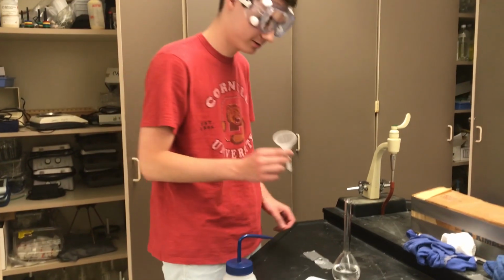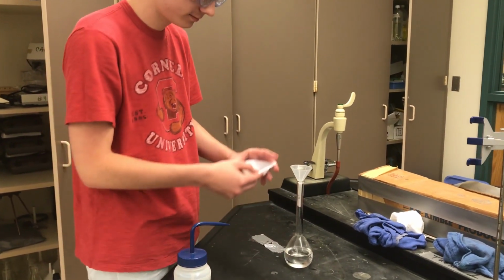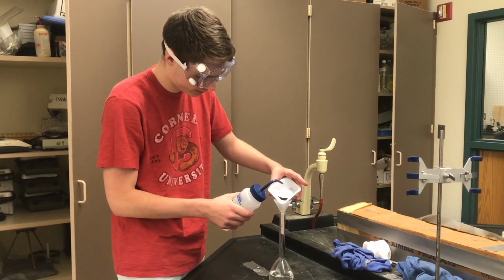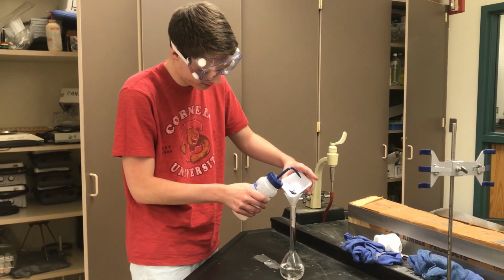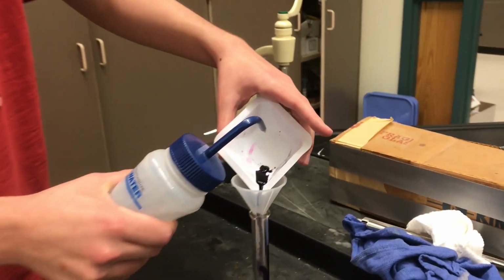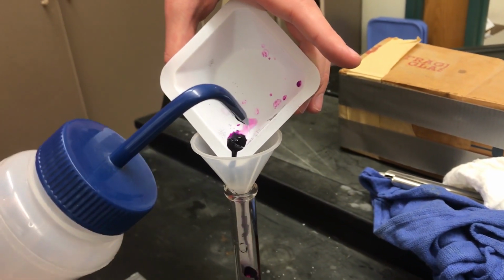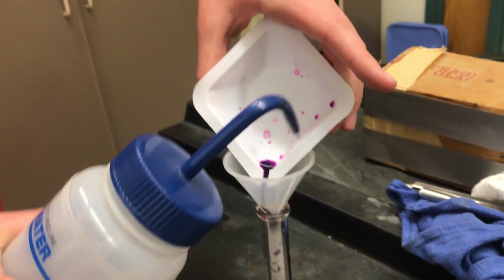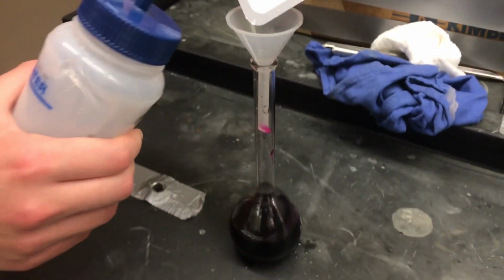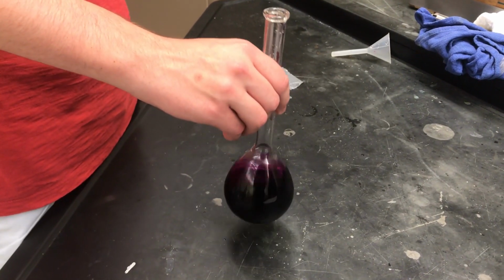Now we're going to use a funnel to get all the potassium permanganate into our volumetric flask. In order to do this, we will use a bottle of distilled water to shoot all the potassium permanganate down into the funnel, making sure to get all the little black specks. All good. Once it's all in, swirl to dissolve.